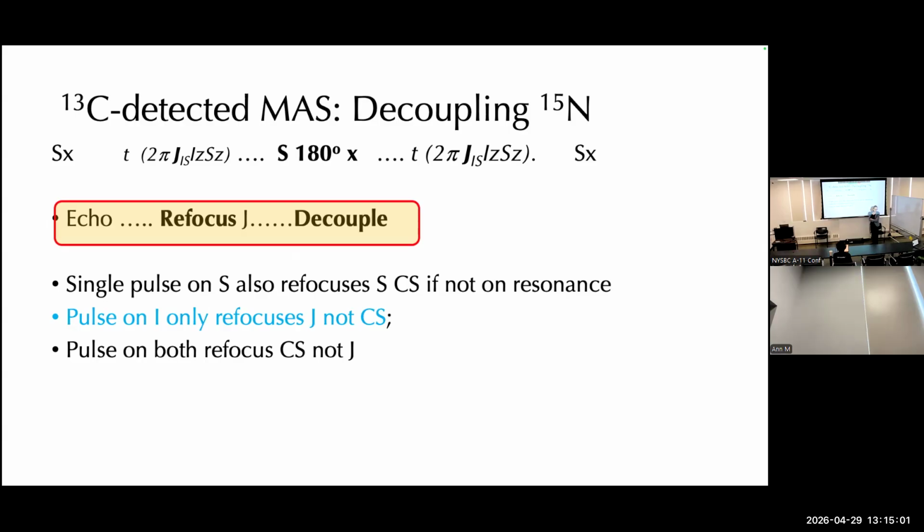So maybe you didn't want to do that. Depends on what you're doing. If you didn't want to do that, maybe you should have pulsed opposite. And that's the more typical protocol when I'm measuring carbon. I want the nitrogen to not show up as being a coupling, so I put a little pi pulse in the nitrogen. You see this all the time in our pulse sequences.